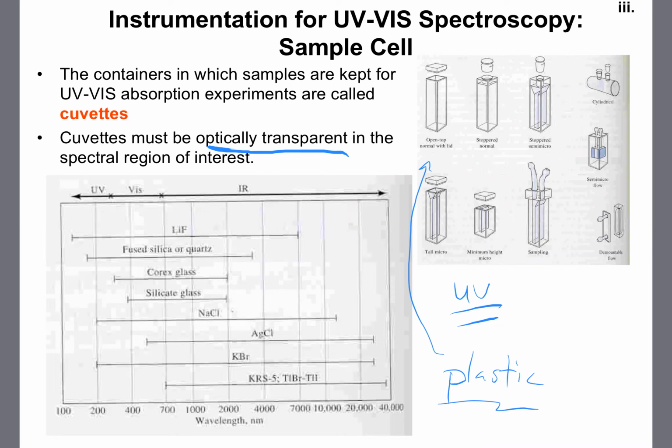And they're very popular because they can be used as single-use cuvettes. You basically run your sample and then throw it away, dispose of it. You don't have to worry about contamination, which is always kind of convenient, right? If nothing else.